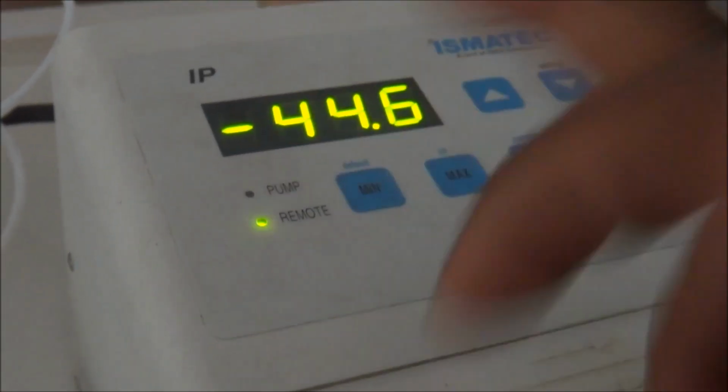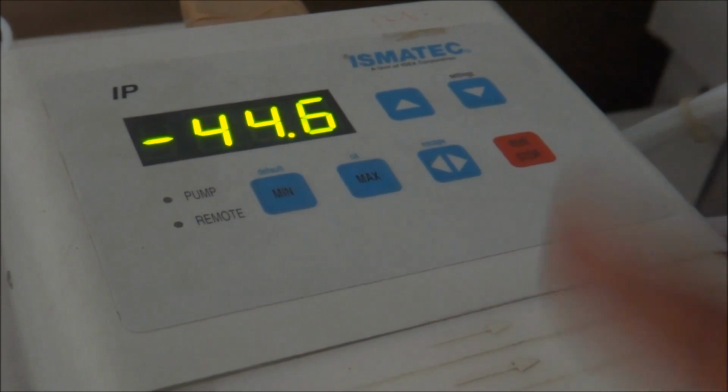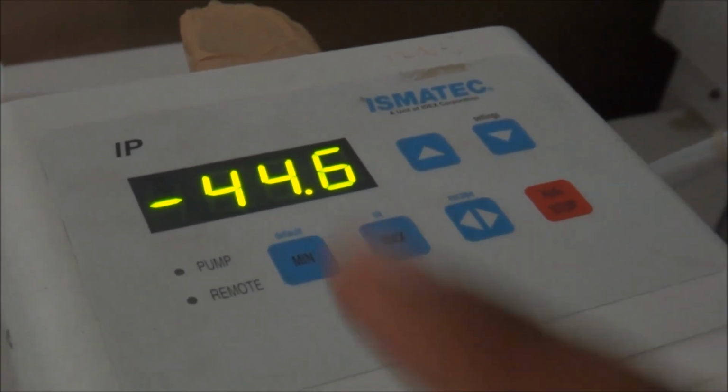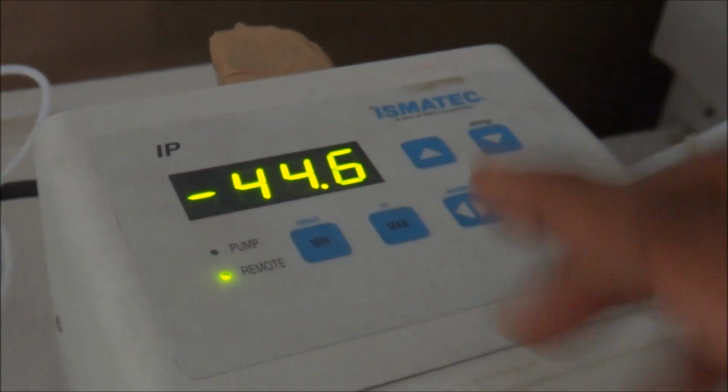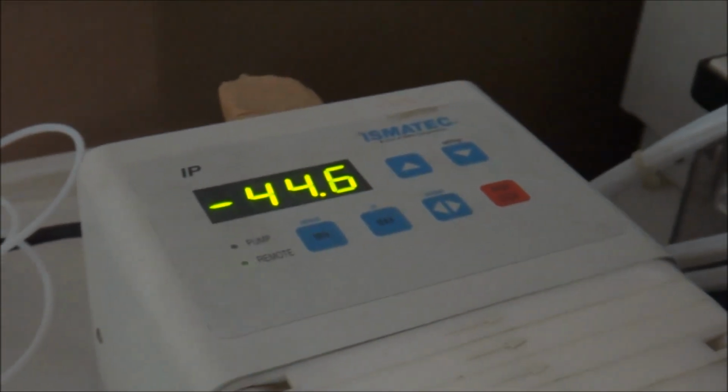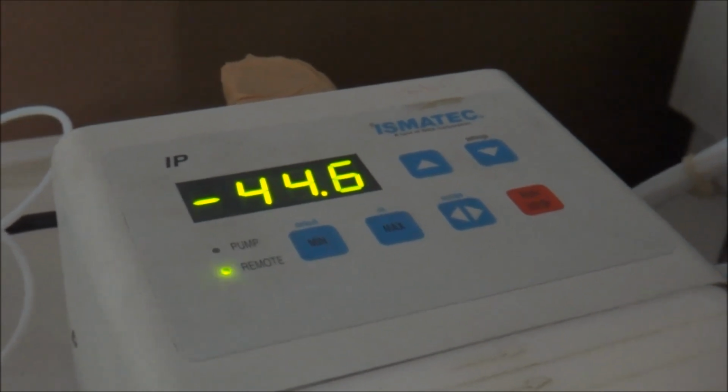Once the forward suction is finished, the sign is going to convert to positive, indicating now the sample is being collected in this direction. So it is going to change the direction, and it is back pumping the excess solvent that is in the tubules, and the blinking of the light indicates it is still under the control of the CPU.